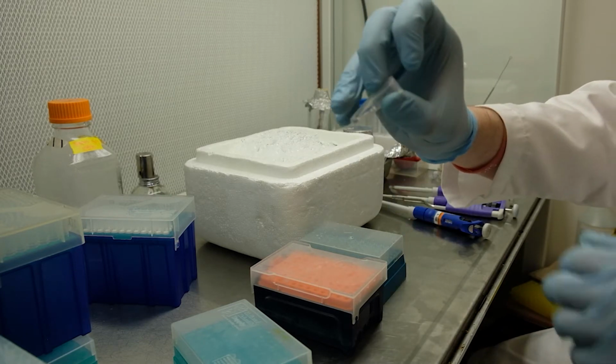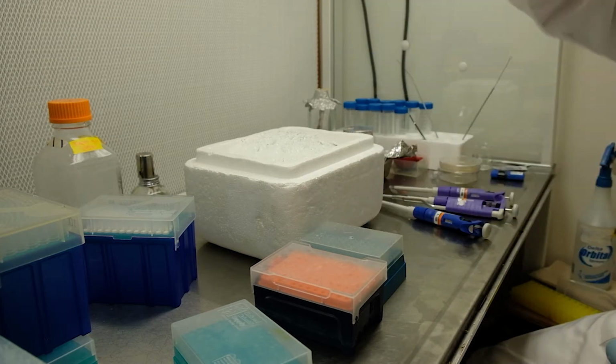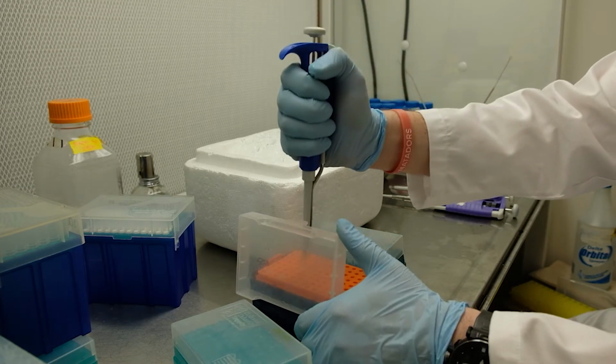Then, add your plasmid. You can calculate the right volume from the concentration of your DNA. Flick your DNA tube to make sure its concentration is even throughout the solution.